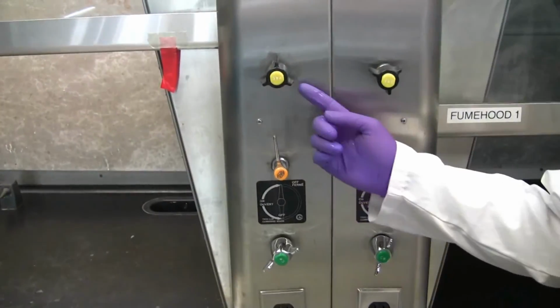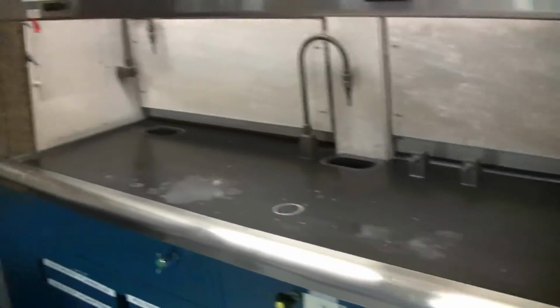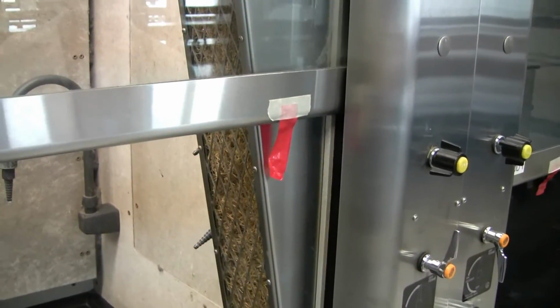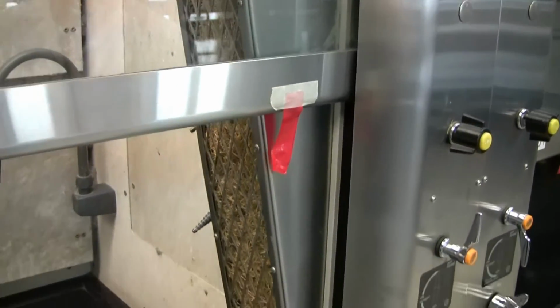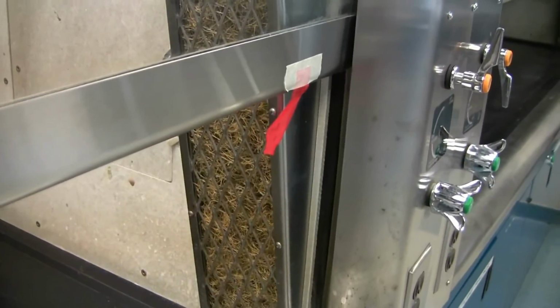There are also several knobs on the side which indicate vacuum, gas, and cold water, which correspond to that fume hood. When starting to work on the fume hood, there will be a red piece of tape. Pull the door down and make sure the air is circulating inside.